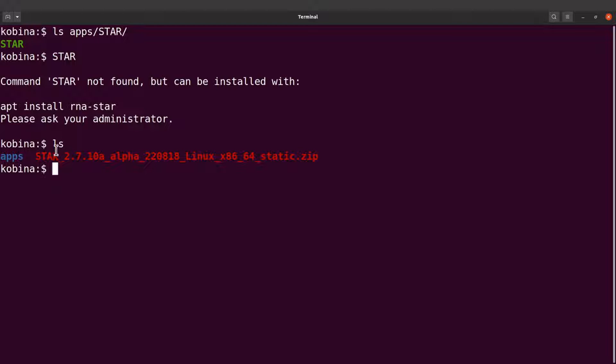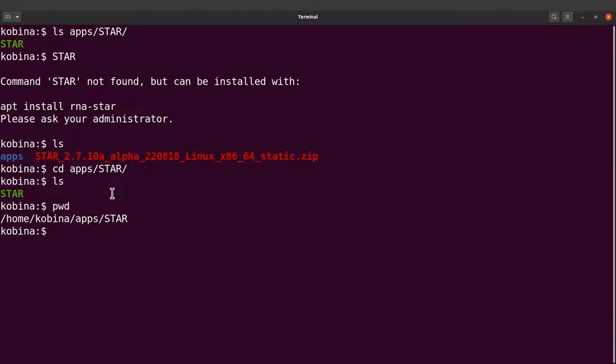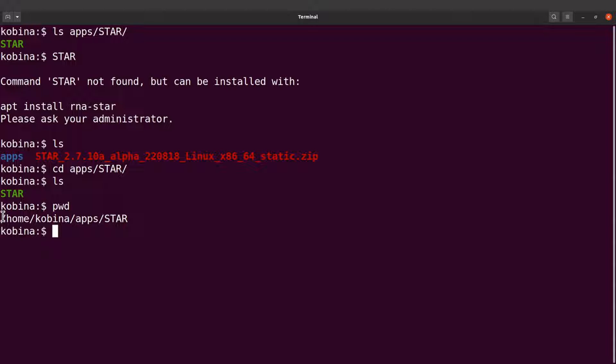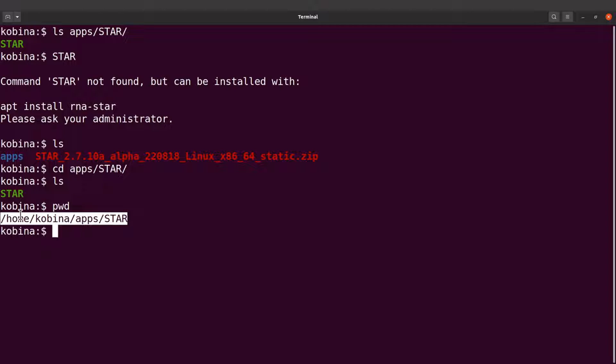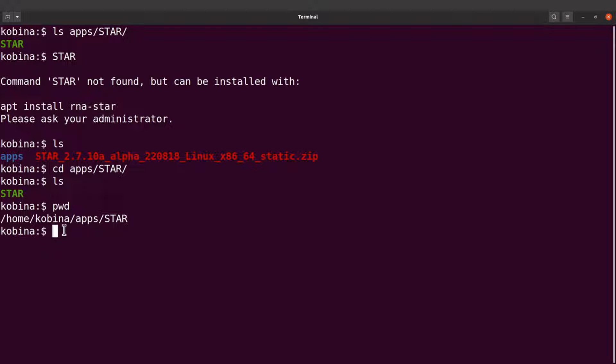That means we have to first get the path, the absolute path to the STAR file. So we have to CD into apps and then into STAR. Of course, if you do an ls, you'll find our file there. We are now going to issue the pwd command, so I'll say pwd, and then I'll get this absolute path. This is what I need. Yours is likely to be different, but make sure you have this and then you can copy it.